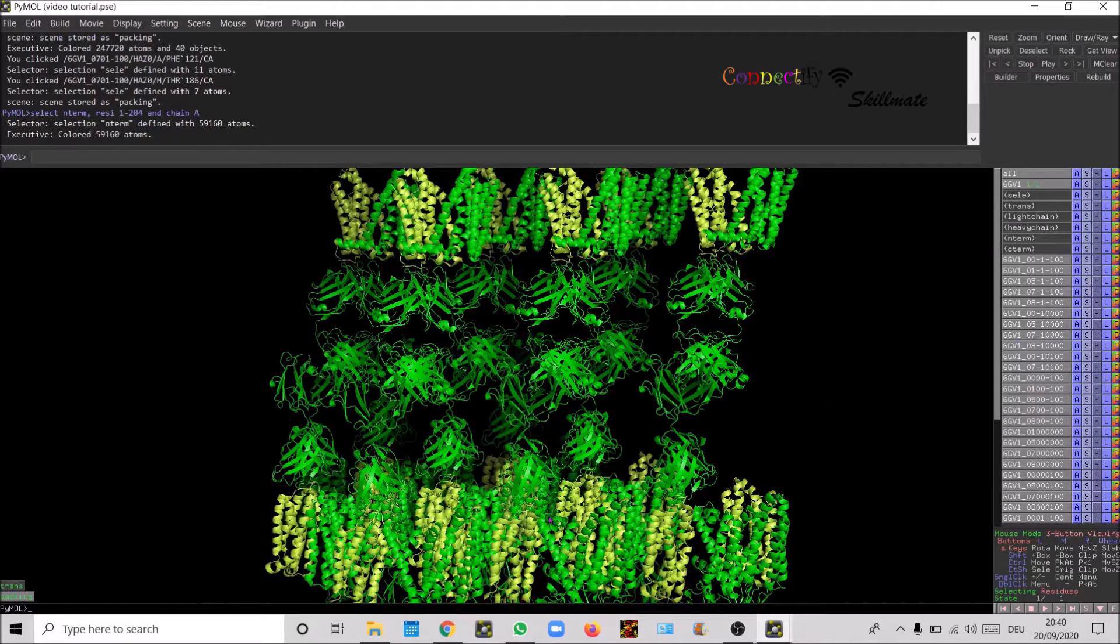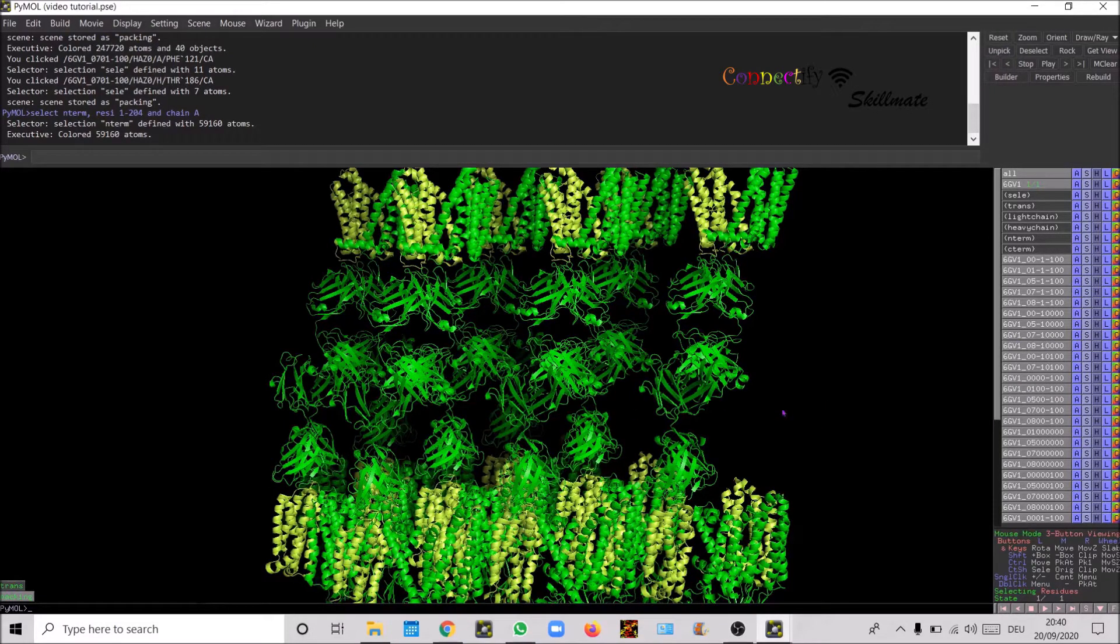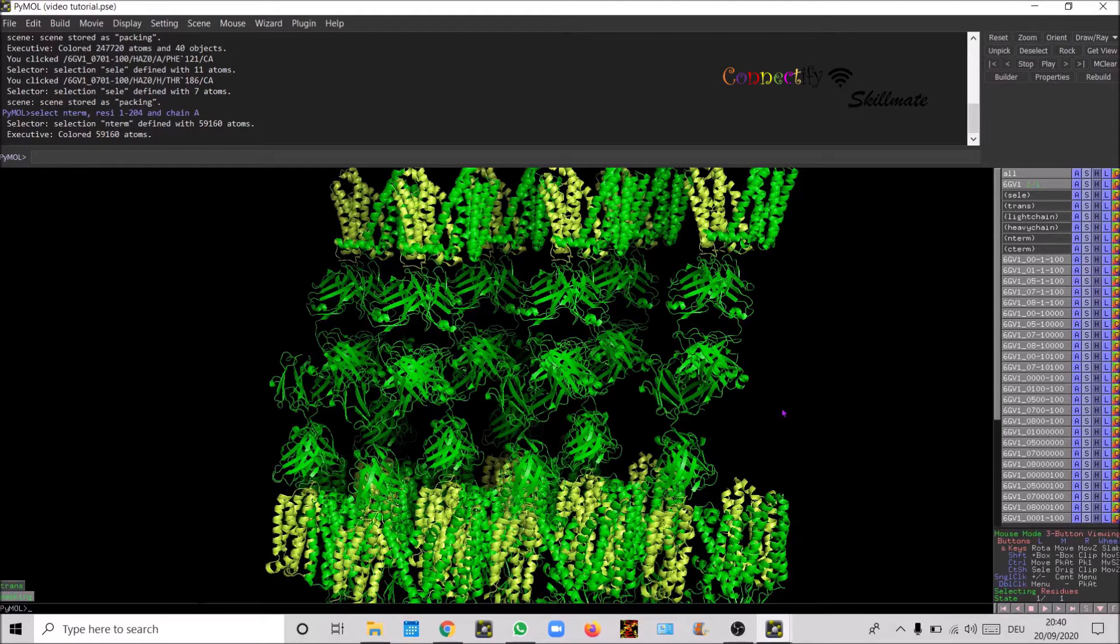Now you can see very nicely the N-term color has changed to lemon.